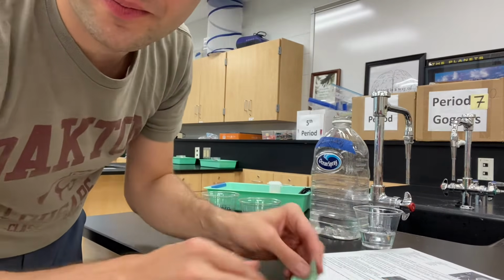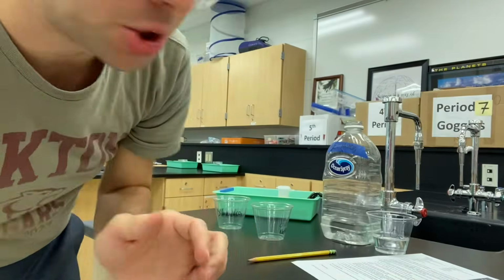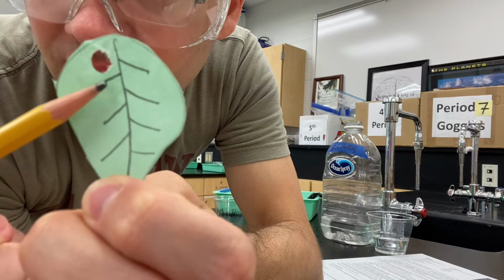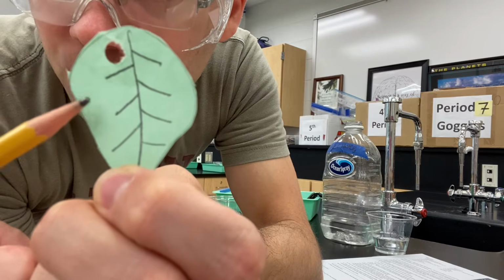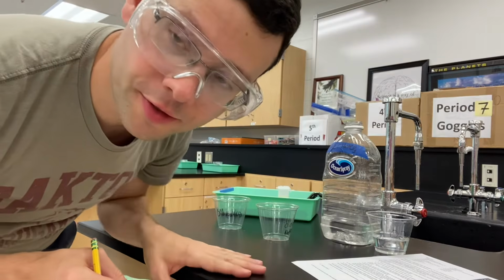You'll have 10 of these little discs. I only have 1 little disc right here. But try to avoid hole punching the veins. These are the veins on the leaf. You don't want to get that. That's xylem and phloem tissue. You want to hole punch off to the side, like all around in here. Try to get as many holes per leaf as you can. And again, you want 10 per cup, which means you're going to want 30 of these total.